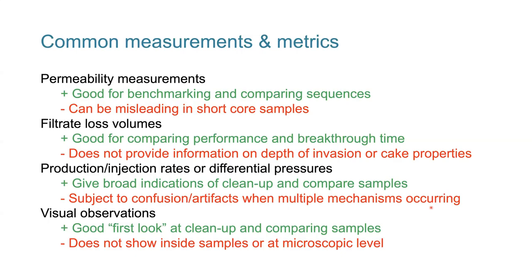So forget about our ambition to have 10-foot long samples. It's not realistic. It's not possible. We're limited by the core. We have to take samples to remove any invaded zones from the core.